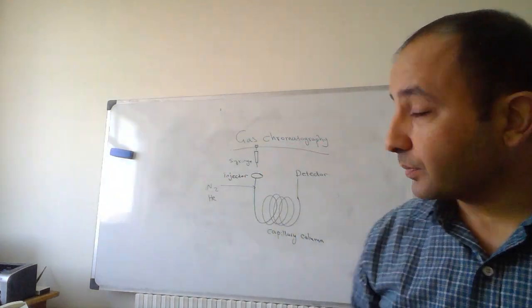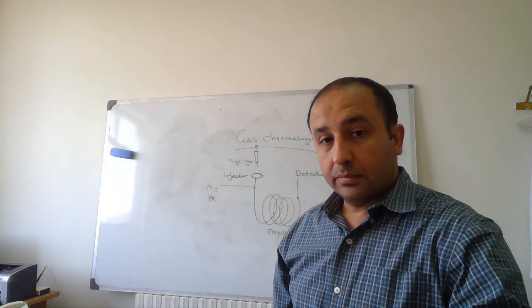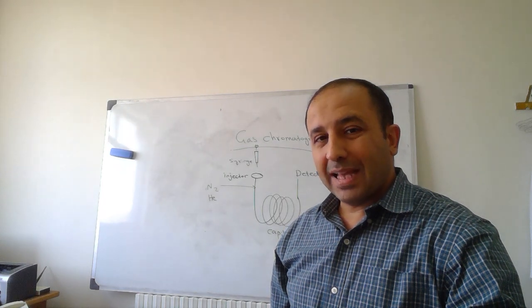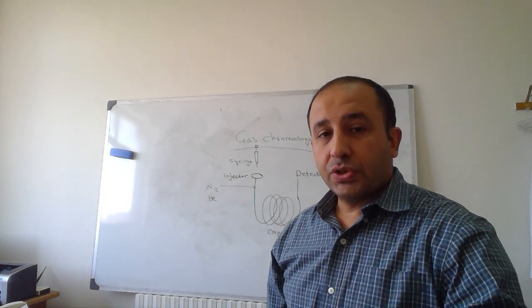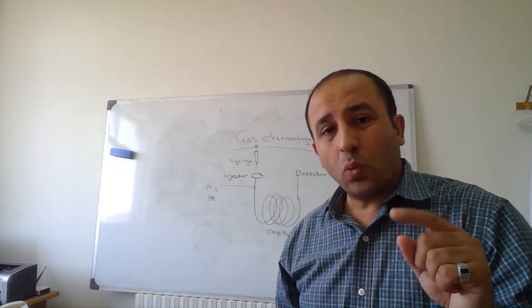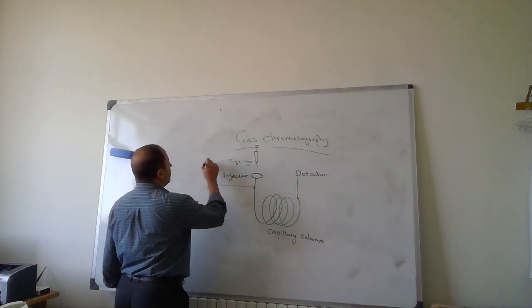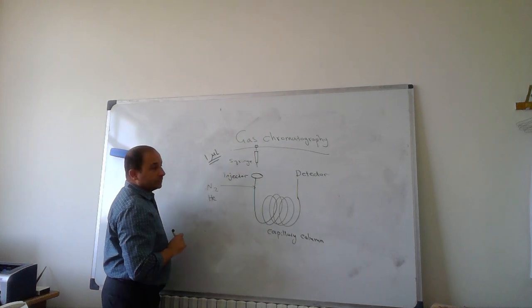Another issue is that the quantity of material should be as little as possible. So usually we inject just 1 microliter. 1 microliter is sufficient.